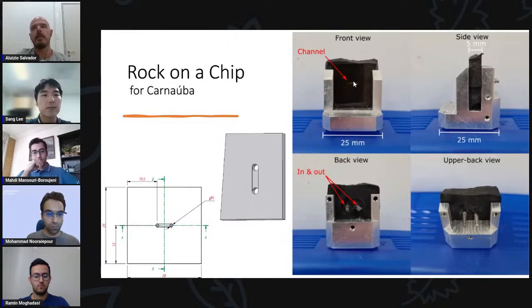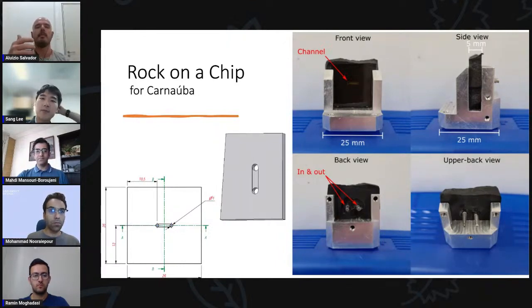So these are primordial conditions to use a beamline to perform experiments in a synchrotron beamline. You need to have a controlled environment, so we can compare measurements before and after the experiment.